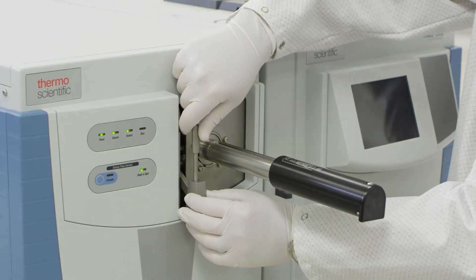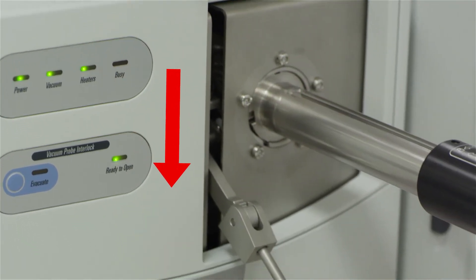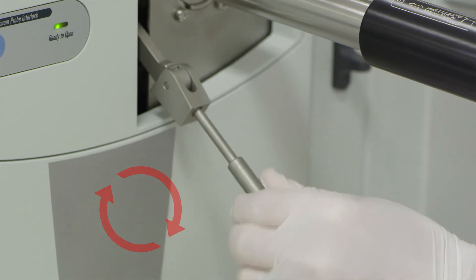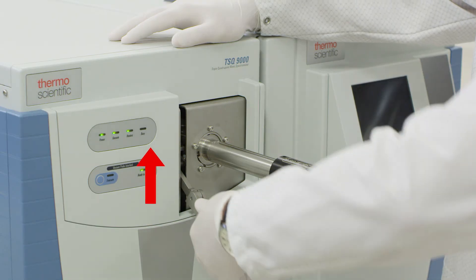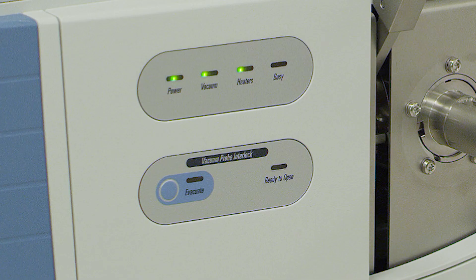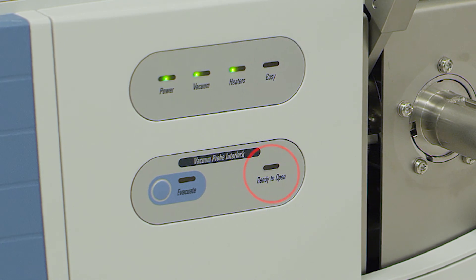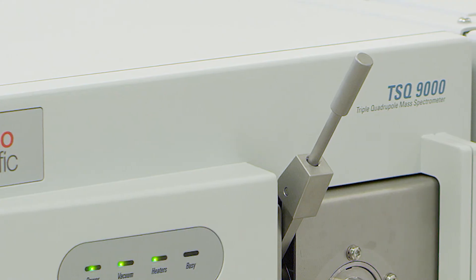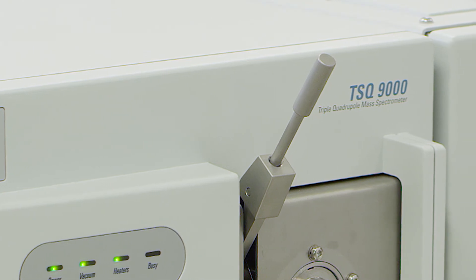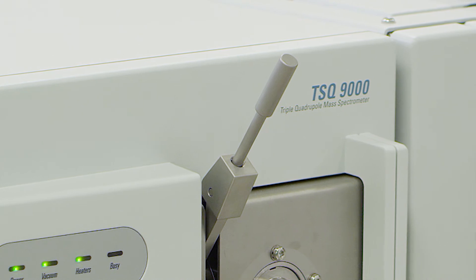First, to change lever positions, unscrew the arm and move down, then re-tighten. The lever is now able to be lifted upwards, freeing the path for the source installation tool. When you lift the lever, you will notice the green light for ready to open is no longer on. This lever must remain completely up while you are inserting the tool; otherwise obstructing the path of the source installation tool may damage the interlock mechanism.